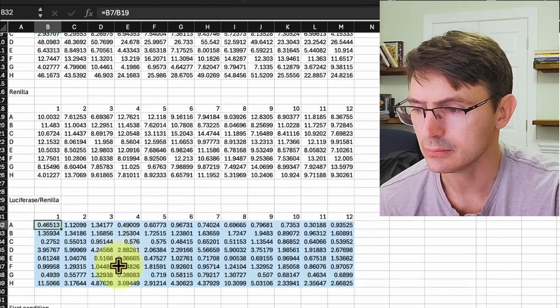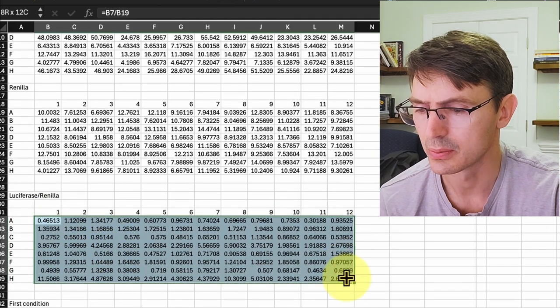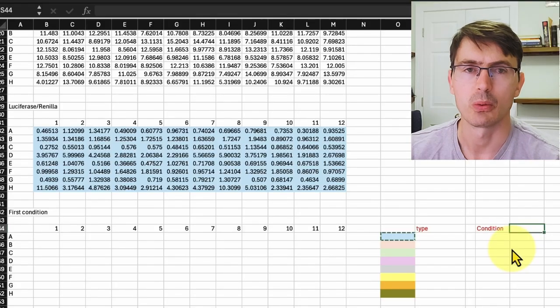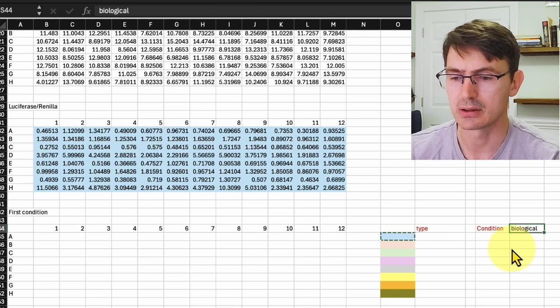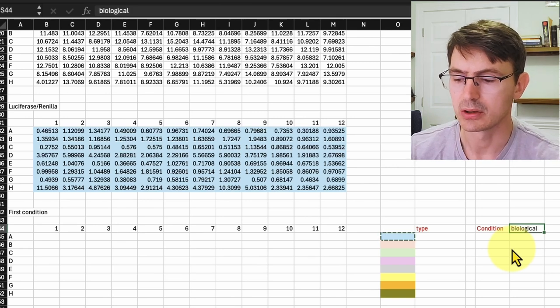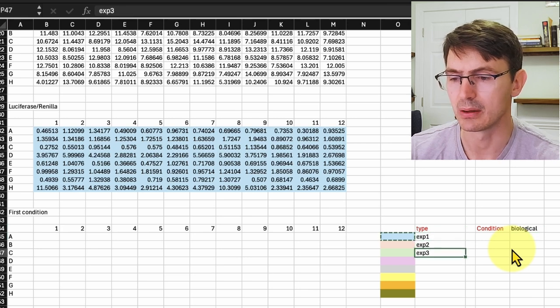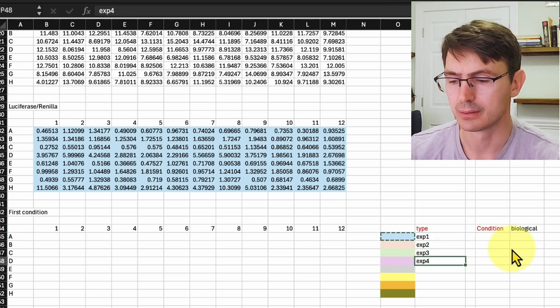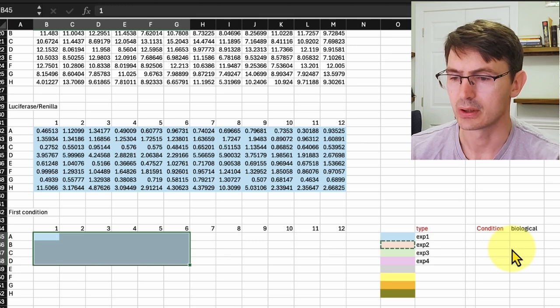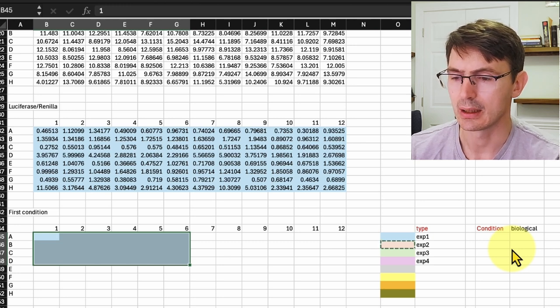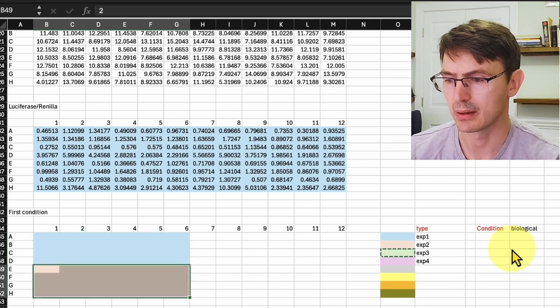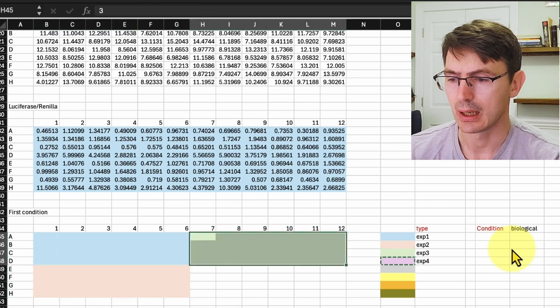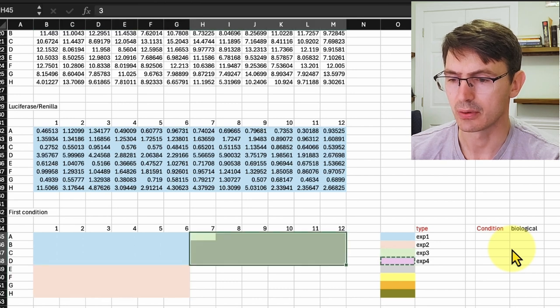This Excel sheet allows you to add the metadata to the plate just by coloring the plate with the different variables. So let me show how it works. For example, we did several biological replicates, so the condition would be the biological replicas, and we did experiment one and repeated it four times. So now we color for the first quarter the cells with the color of experiment one, and then we do that for experiment two below, and we do the same for experiment three and experiment four, so we have all the different colors.